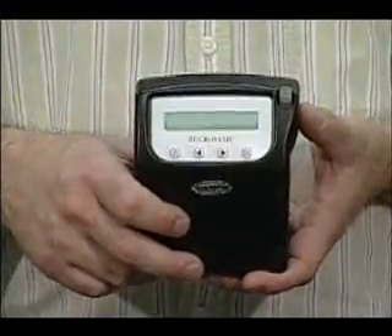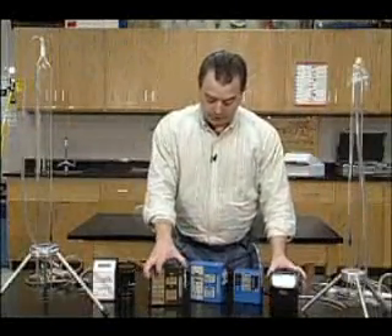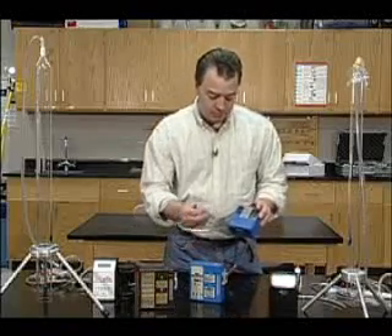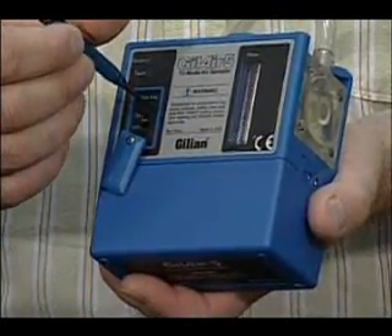The buck pump is the lightest, and it's the only one that is adjusted by buttons on the keypad. The other ones, we adjust the flow rate with this little screw here, and then you screw this little cap on so nobody can mess with the pump.